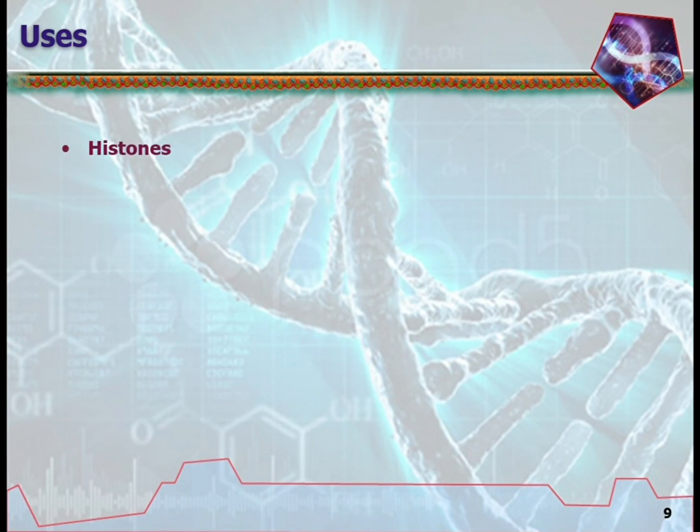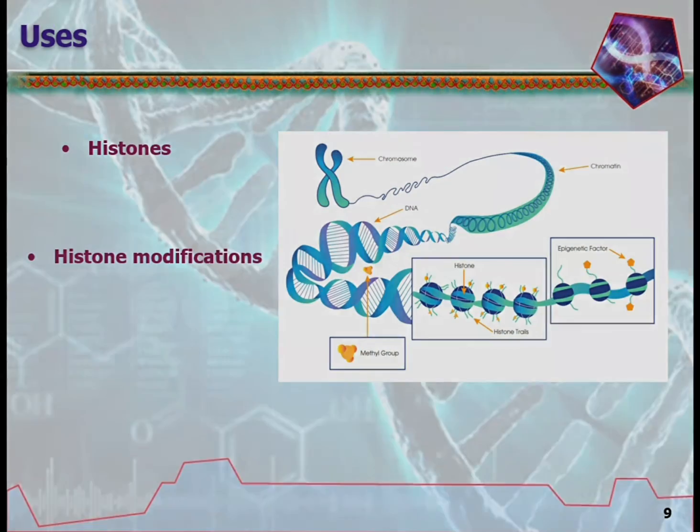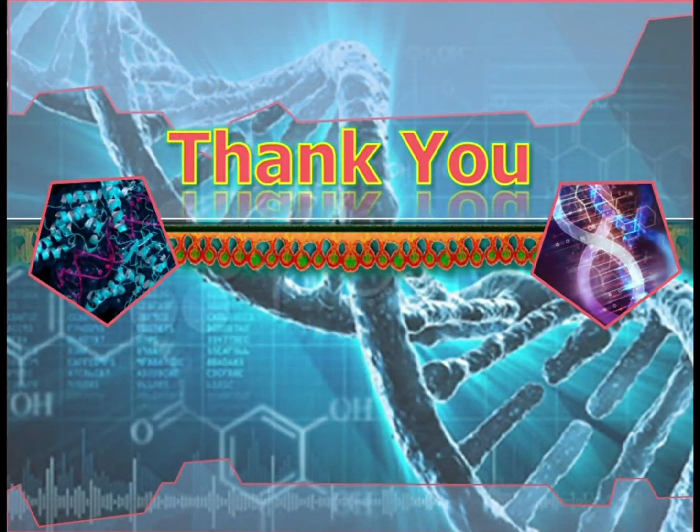ChIP can also be used to study the interactions between DNA and histones or DNA and histone modifications. This was my topic for today.